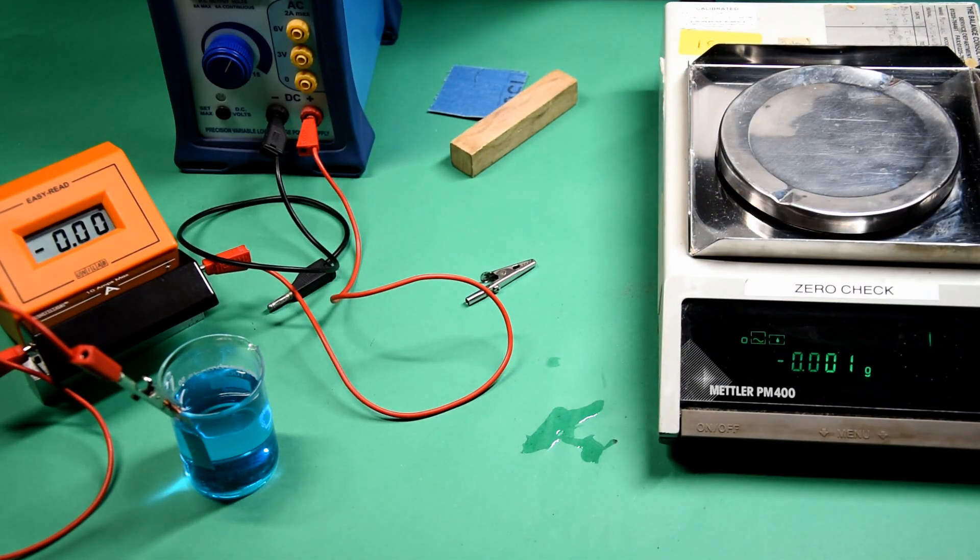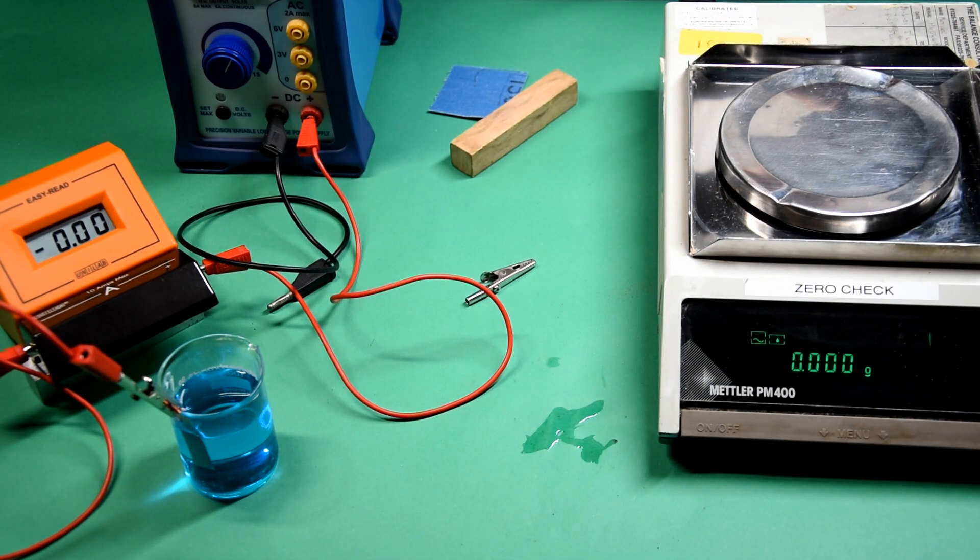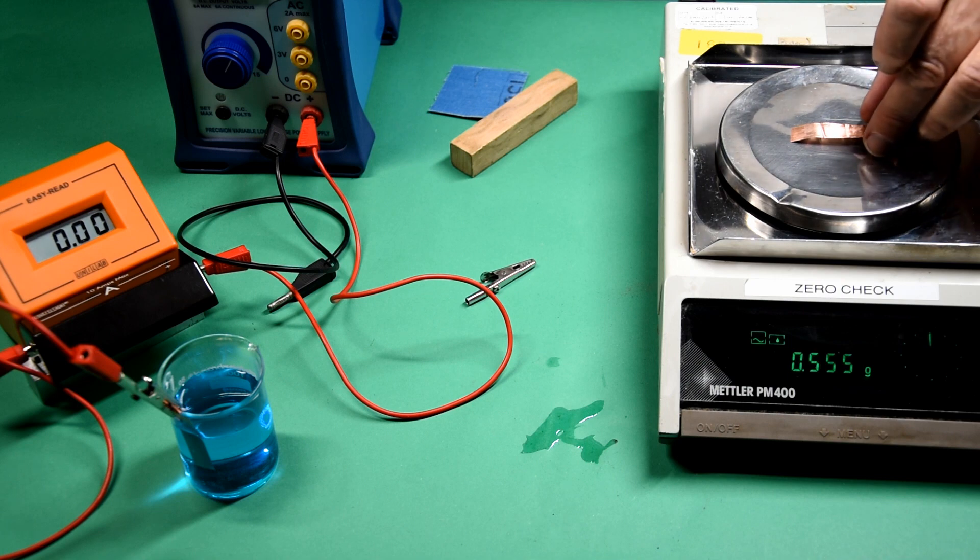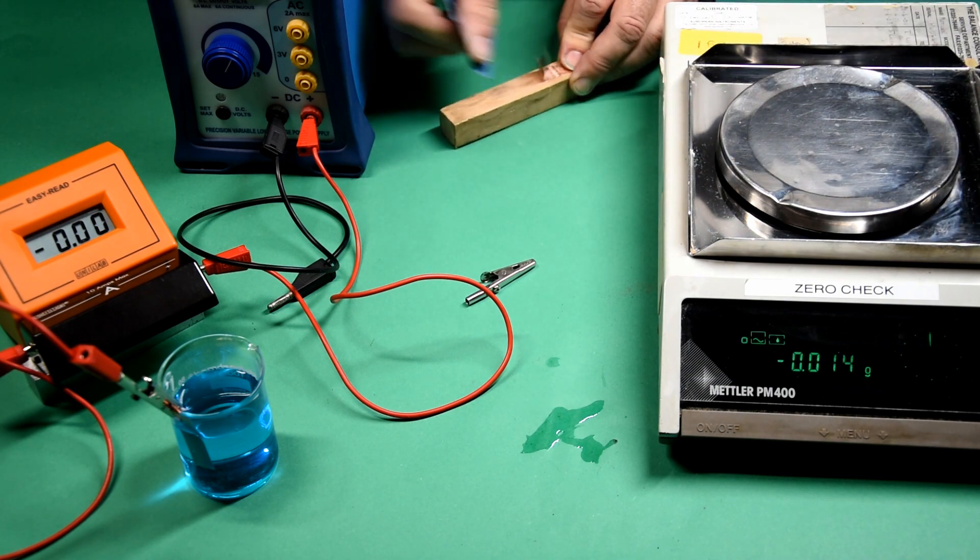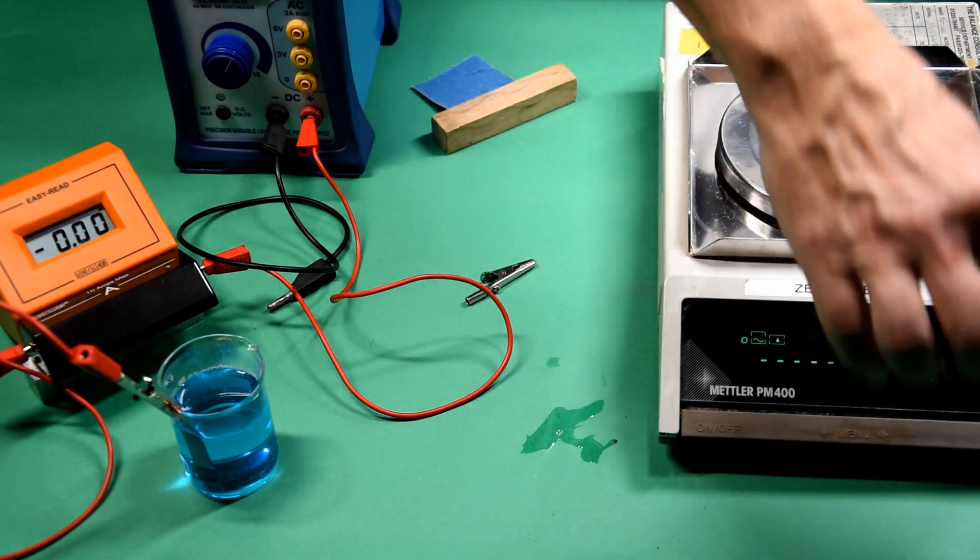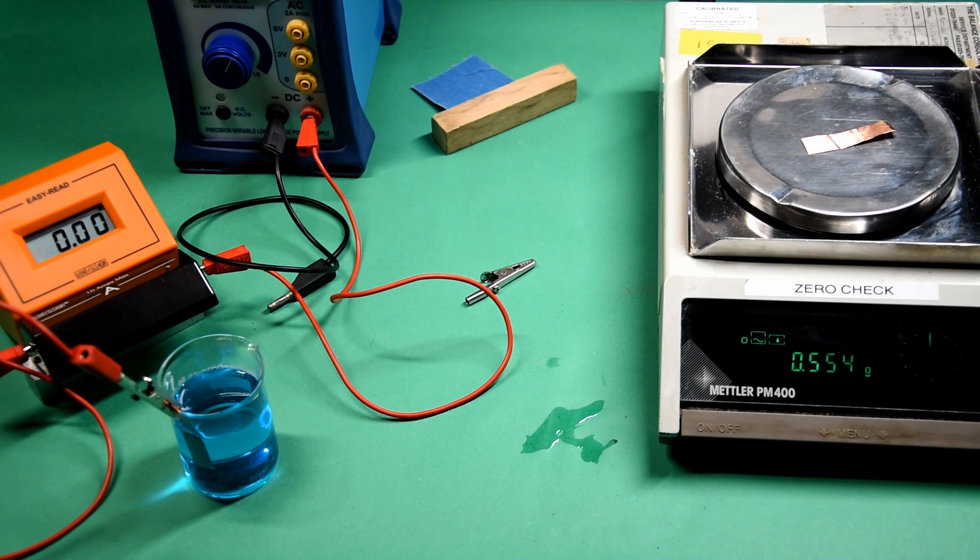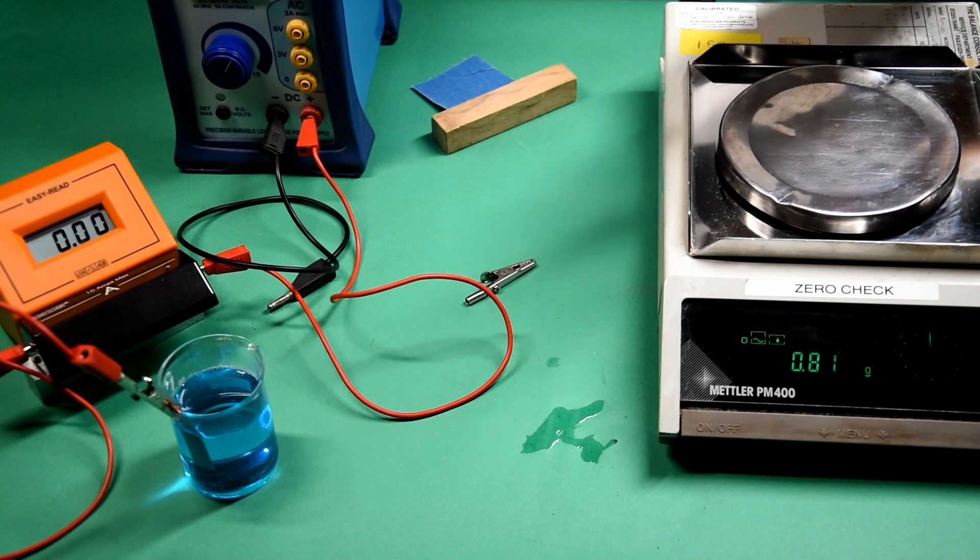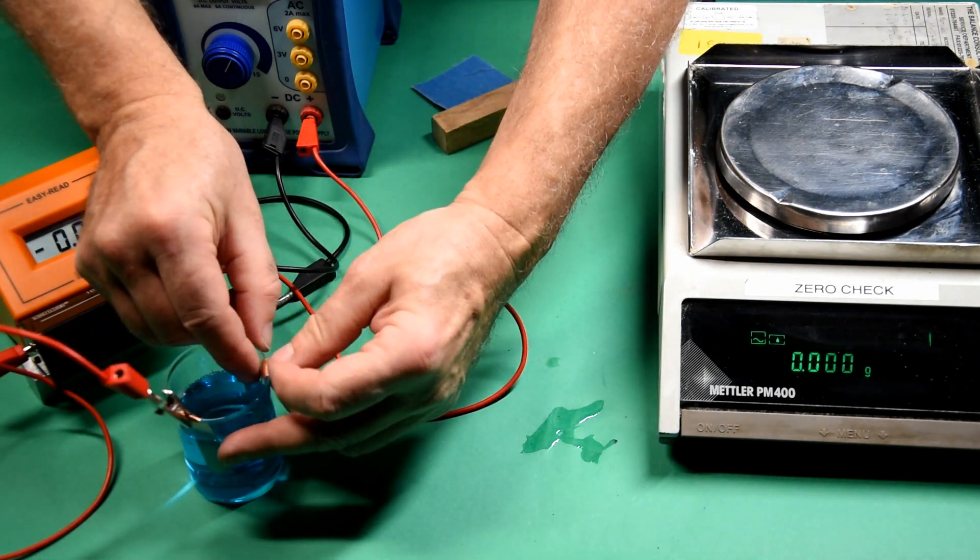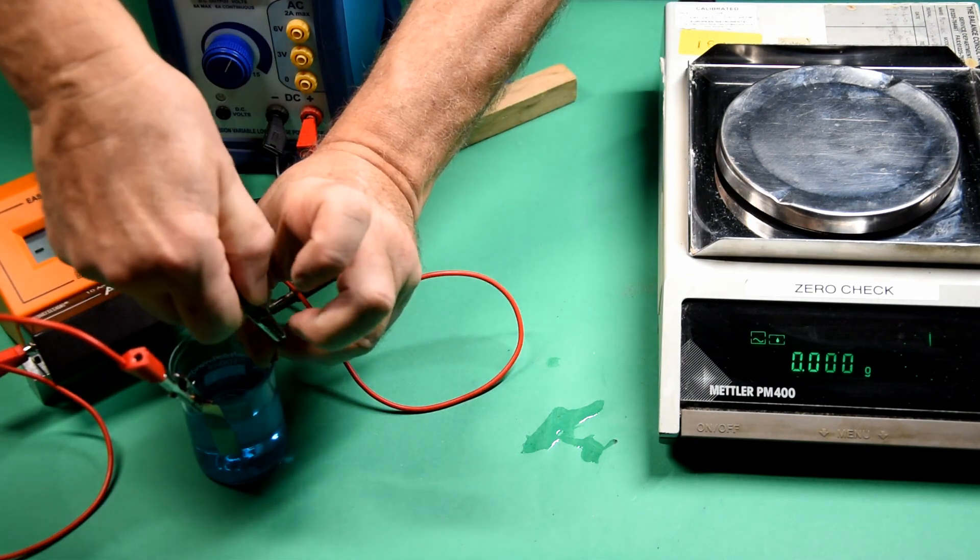The process is repeated for the cathode, remembering to clean it again with emery paper.